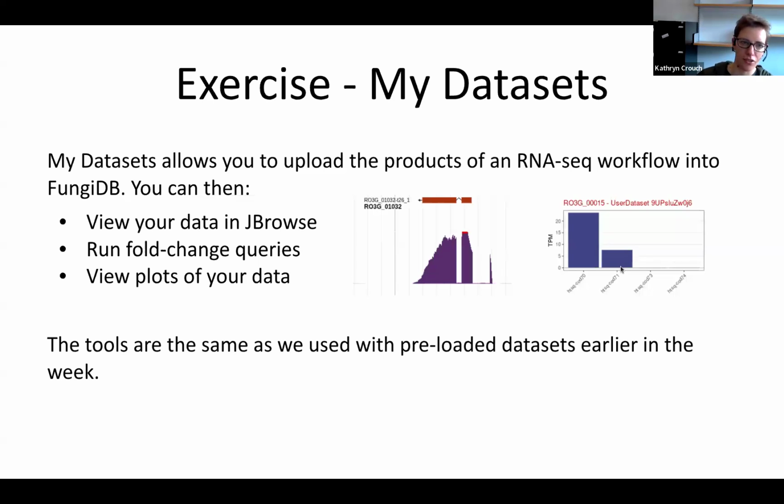Those will be generated for you automatically. So the first exercise on Thursday is understanding how to do that and how to access data if you've uploaded it. And if any of you have your own data and want to try and get an RNA-Seq workflow running so you can look at your own, please let us know.